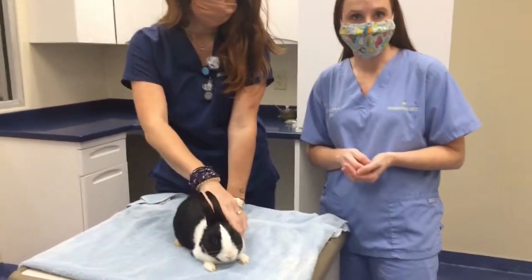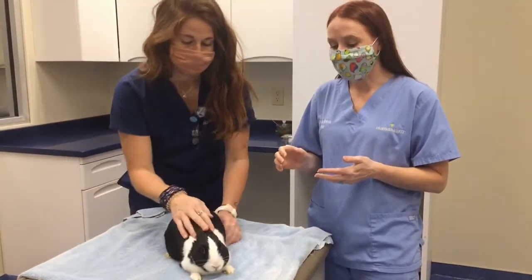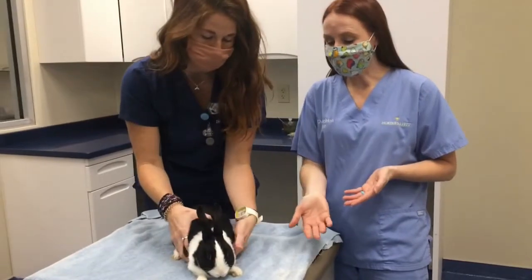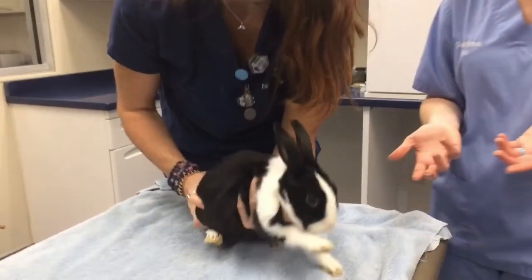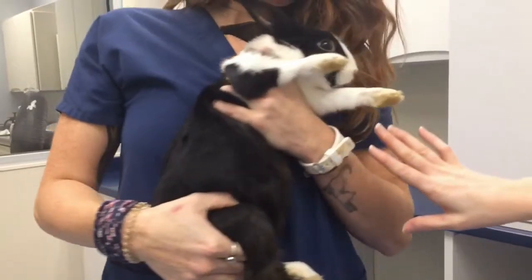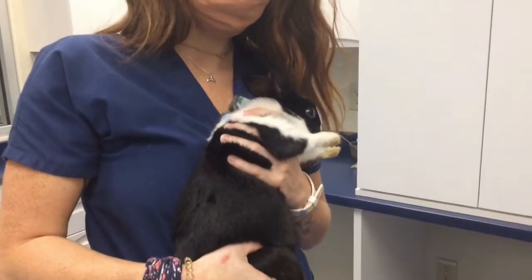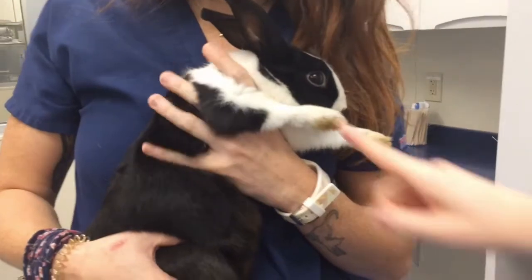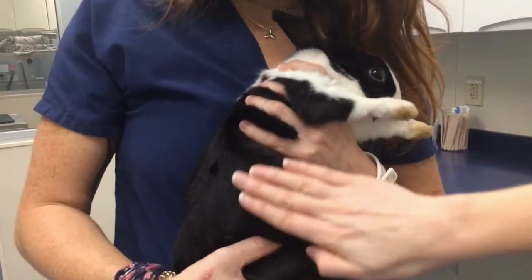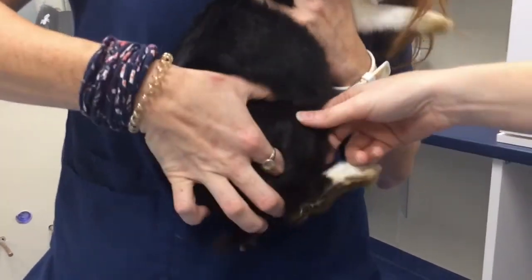The safest vessel we usually go for is the lateral saphenous vein along the outside of the leg. For that type of hold, we do need them to be secure. Kate is going to put her hand under Moo's chest, gently turn him, using her body to have Moo up against her. She's using the basic hold along the arms with her pointer finger in between the legs, and then the rest of her hand gently resting along the chest area. The rest of the body rests along Kate, and then she's able to take her other hand to hold off on that leg.